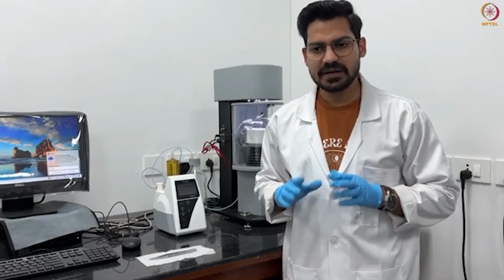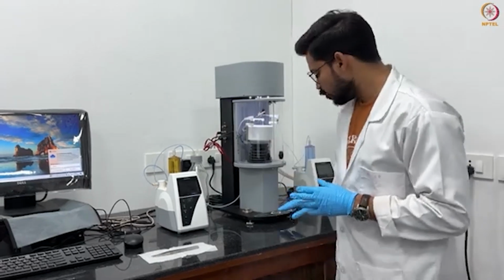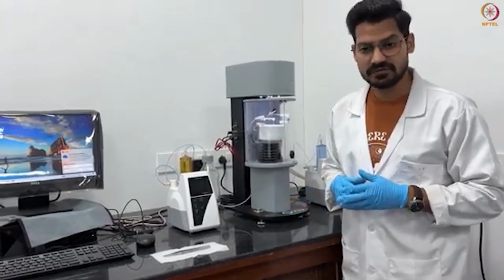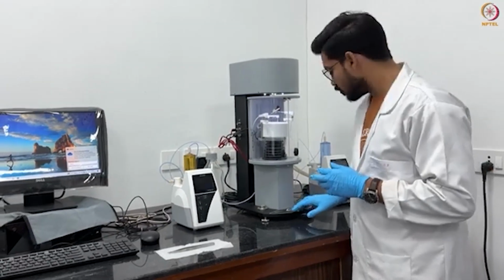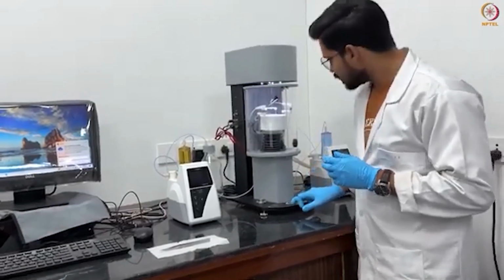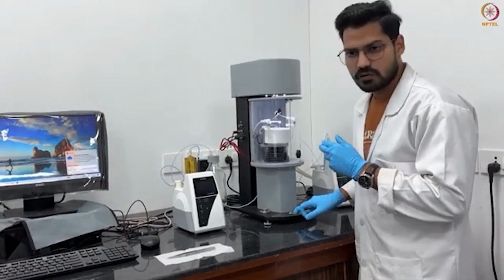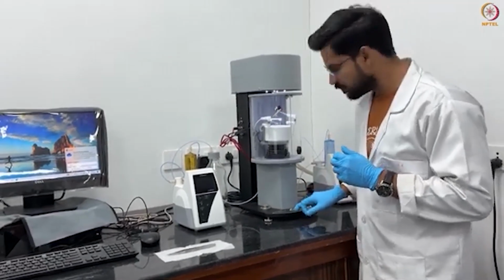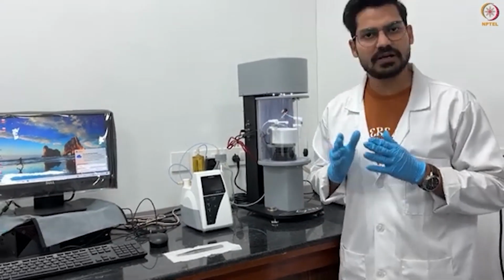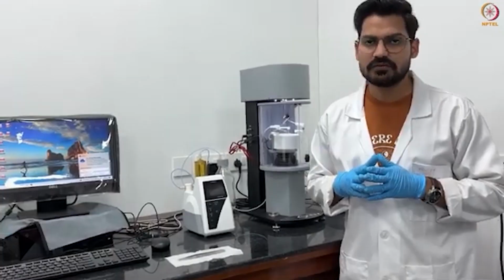Once the experiment is complete, we will lower the stage manually. You can also use the software to lower the stage, but I prefer doing it manually for better control. After the stage is in the bottom position, carefully remove the ring without causing any disturbance. Finally, follow the cleaning procedure again to ensure the setup is ready for future use.